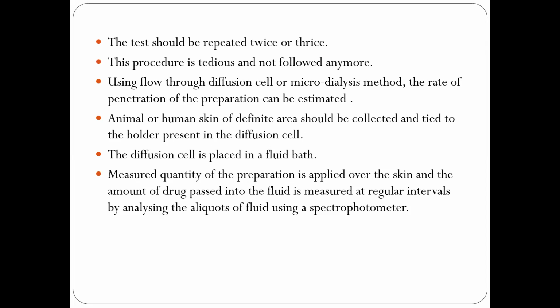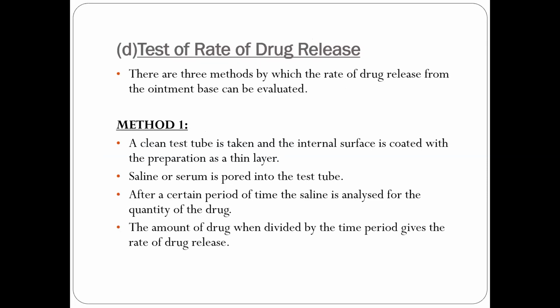So then the diffusion cell is placed in a fluid bath, and we can measure the quantity of the preparation which is applied to the skin, and the amount of drug passed into the fluid is measured at regular intervals by analyzing the liquid of the fluid using a suitable method.